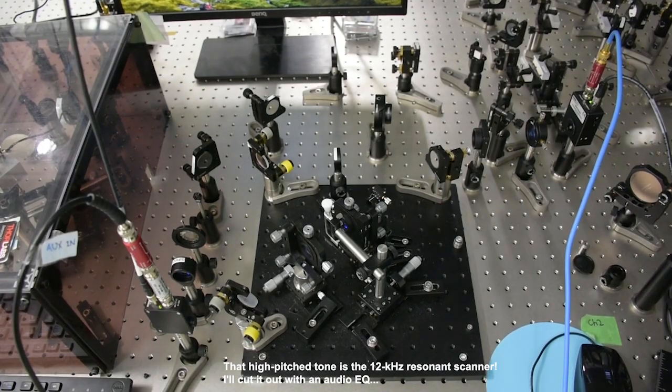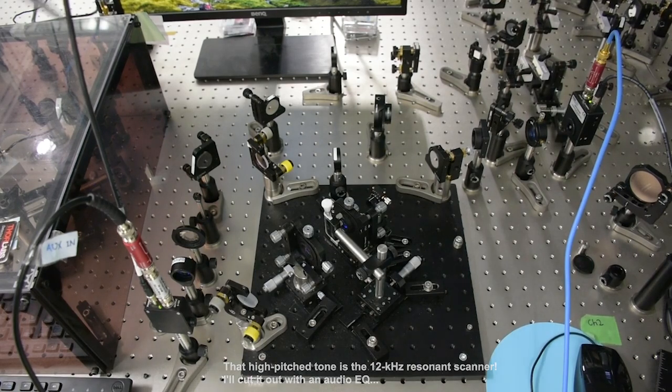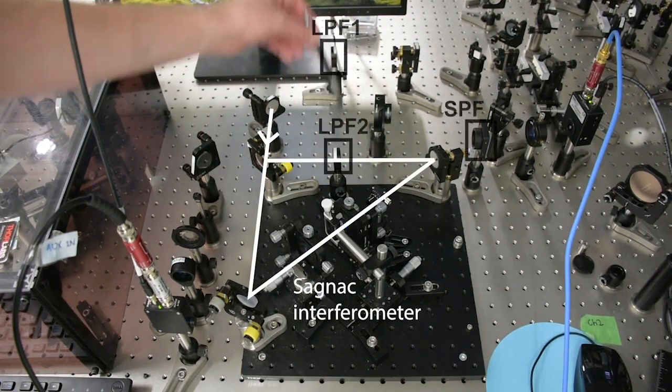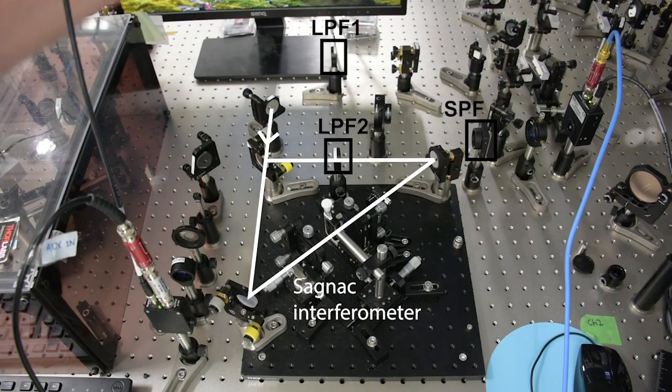All right, welcome to the heart of DIVS. This is the Sagnac interferometer with some optical filtering integrated to detect both SEISRS and FT-CARS.